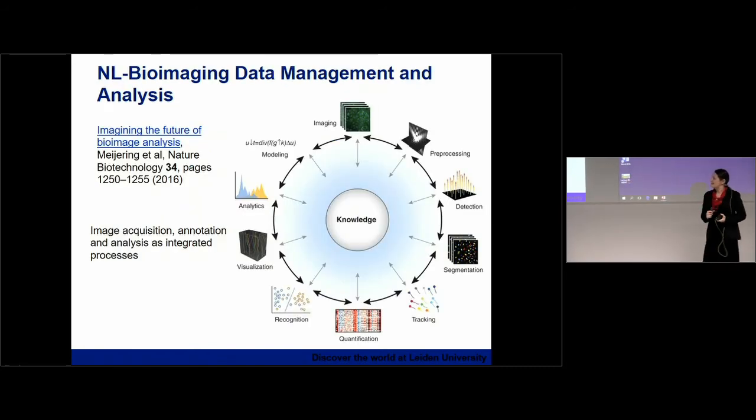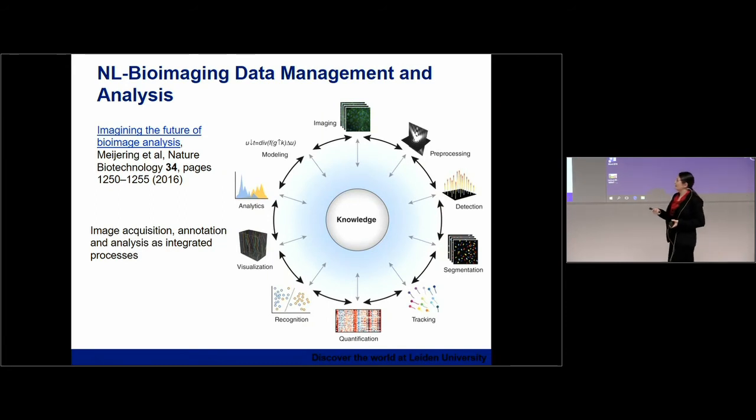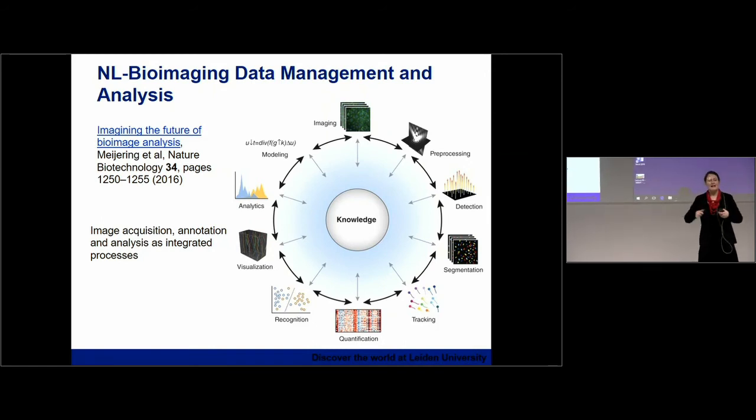So, what are the incentives for an individual scientist? Well, Bernd already outlined the fact that once you have your image, there's probably an awful lot of work to do on processing and analyzing the data before you can actually understand what those images are telling you. And if you have an environment where you can do the acquisition, the annotation, and the analysis all together, then that is an incentive for the individual, especially if you're not yourself an expert in machine learning or in these advanced analytics techniques. If there are tools and resources that you can tap into that the rest of the community has built.